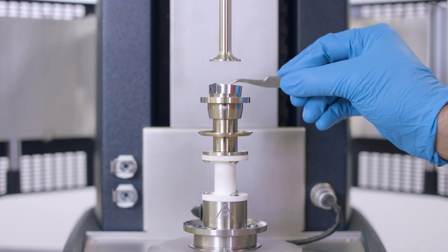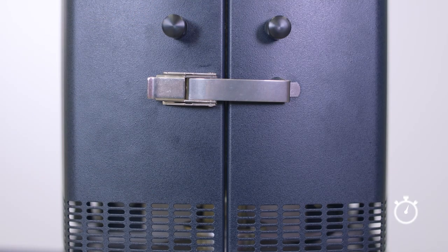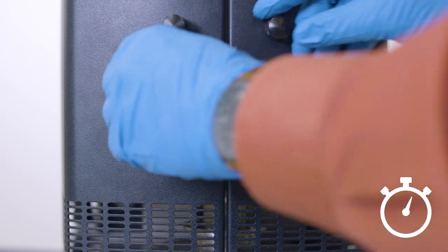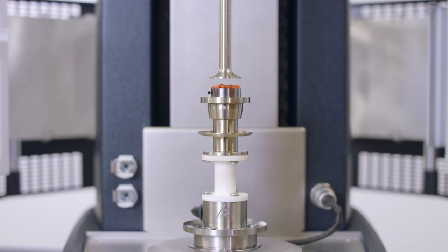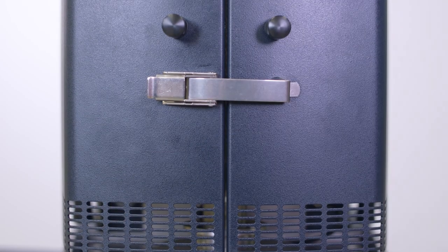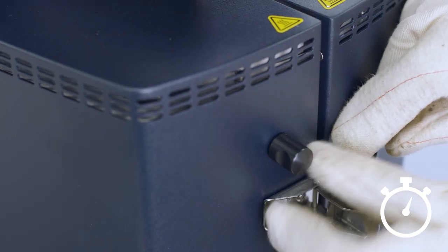Insert the polymer melt ring around the lower plate and close the oven immediately. After about two minutes of equilibration, open the oven and load the pellets or the powder sample onto the lower plate. Lower the upper geometry until it is near the edge of the melt ring, taking care not to crush the ring, and close the oven immediately.